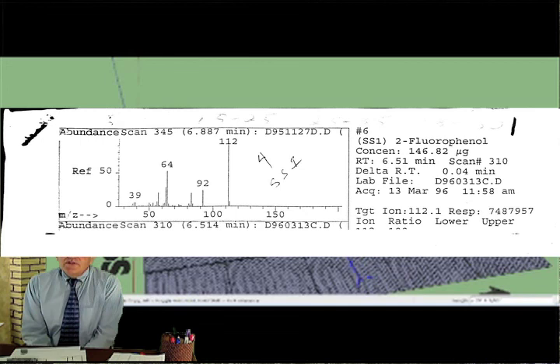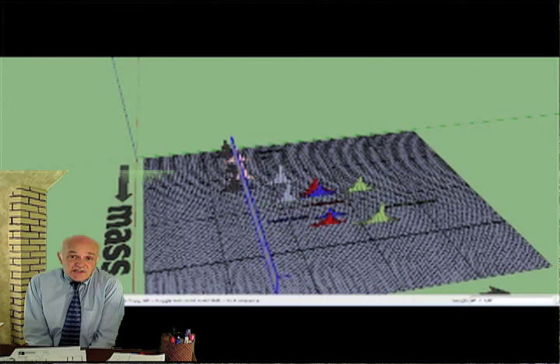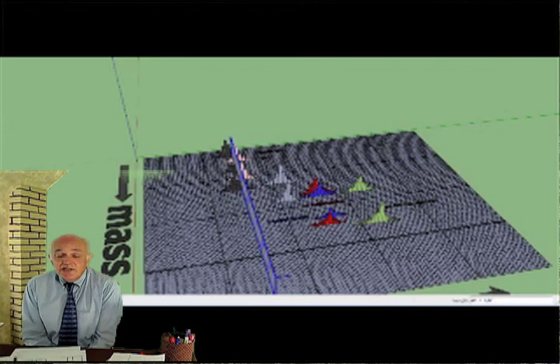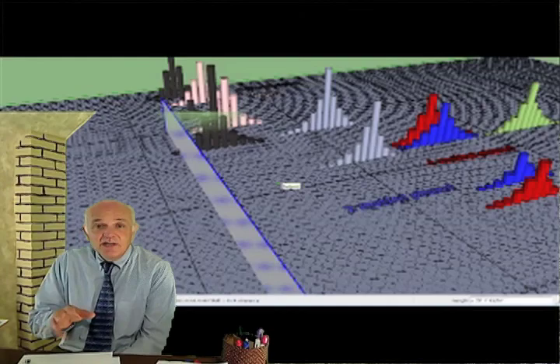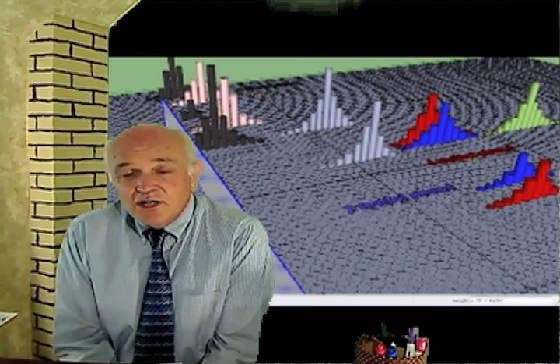These mass spectra are usually pretty messy. And the peaks coelute. And of course, if you pick one spectrum with a coeluting peak, the spectra are going to be mixed together. So the standard procedure is to pick the spectrum you want, pick a representation of the garbage, and then subtract the spectrum. And this is typically all a right-click function. And then when you get the one you want, do a library search, again as a right-click function, and it'll tell you what it is. Depending on how the software is set up, it'll typically give you up to 20 possibilities with a probability match according to each one. You can print them out or just look at them and see what it is.